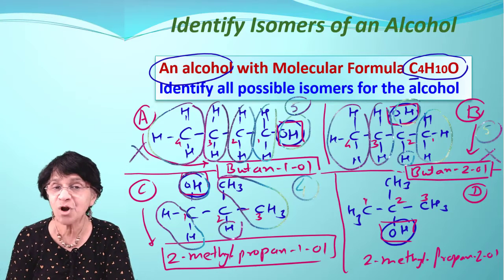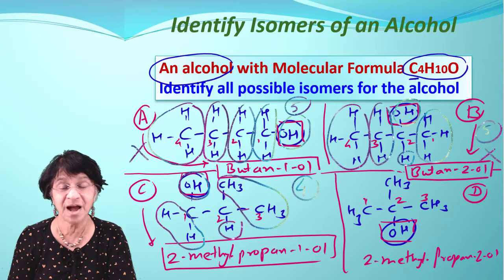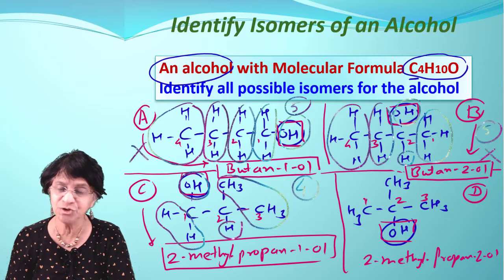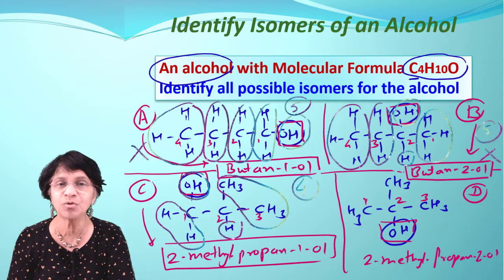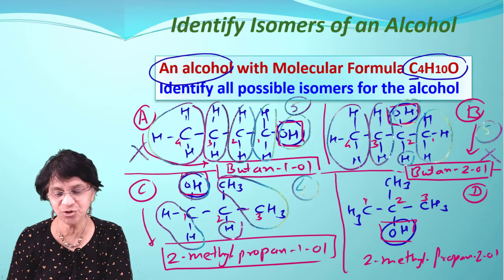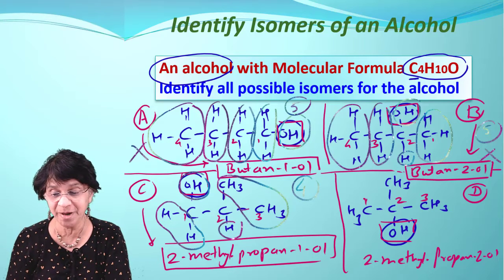Now remember, we are talking about an NMR spectrum which is not of very high resolution, because if that spectrum is quite high resolution, you may end up having a little bit more doublets and a little bit more splitting pattern for all that. So for the information provided to us, compound C is going to give you 4 peaks.